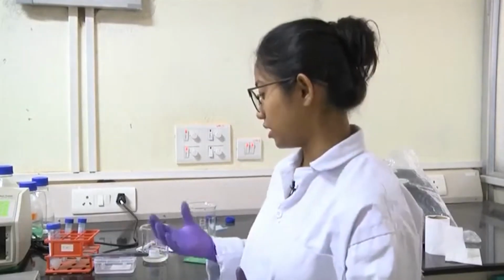So during Western blot, you should standardize these parameters. You should try different times and different intervals, and based on what you feel is proper for your protein, you should standardize the parameters and go for this technique.